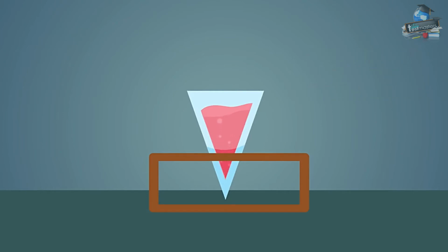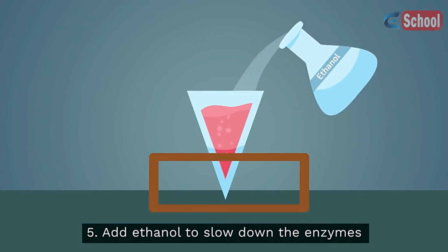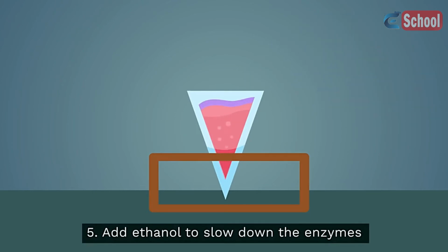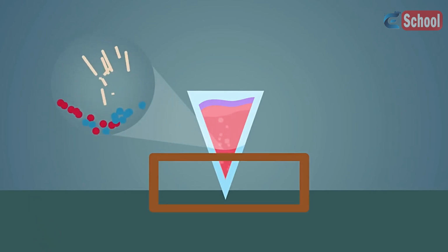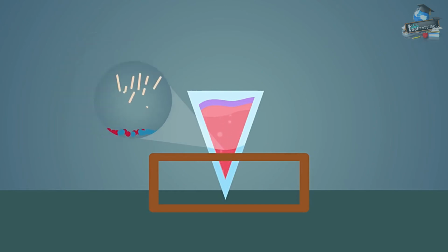You can't yet see the DNA because it is dissolved in the mixture. To see it, you have to make it insoluble. To do this, you slowly pour ice-cold ethanol into the mixture. The ethanol is at this low temperature to slow down the action of enzymes naturally present in the cell that will break down the DNA. In a normal, healthy cell, these enzymes are usually kept separate from the DNA by the nucleus membrane, but you ruptured this in an earlier step.